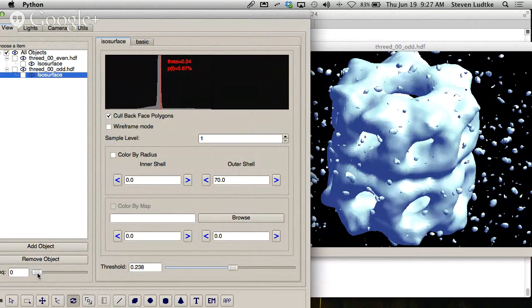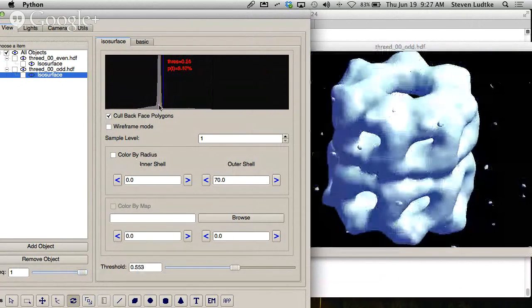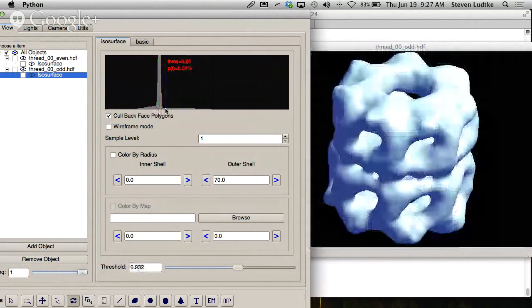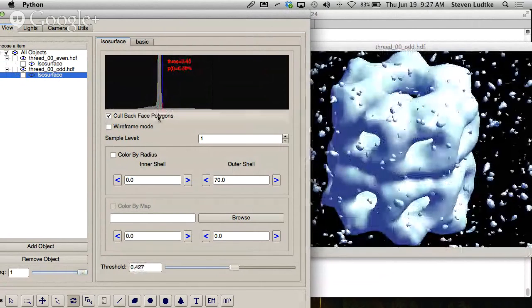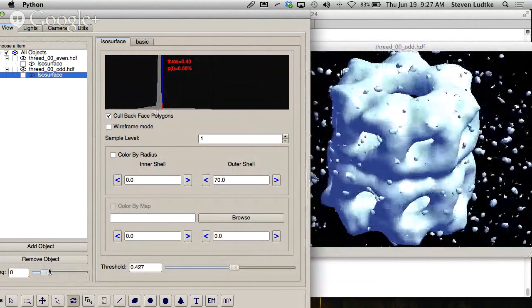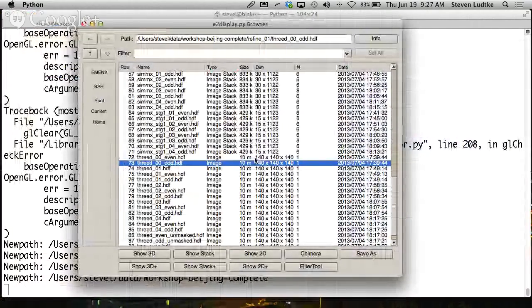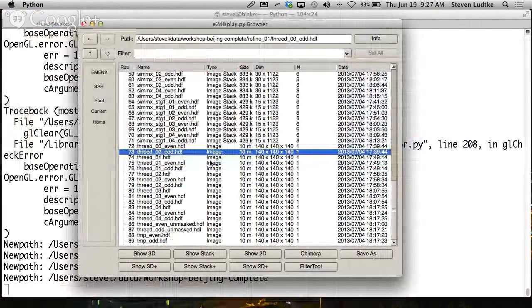Maybe we'll do that on this one too. Now if we switch between those two, you can see all the high-resolution noise that's present in there is completely different. And these structures are actually pretty different all the way out to sort of 20 angstroms. So our two starting models are starting from very different places. So if, despite that fact, they still converge to the same final answer, then we can be very confident that the data really represents only one structure. That structure is self-consistent and gives us the same answer.